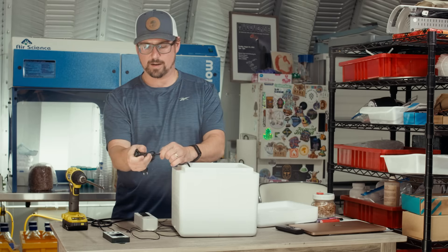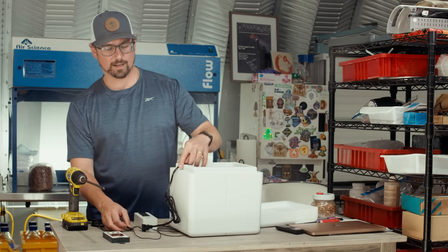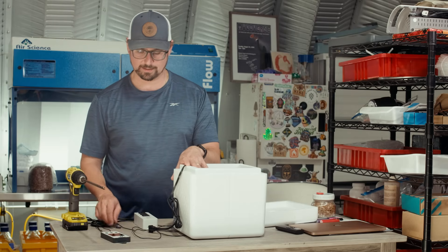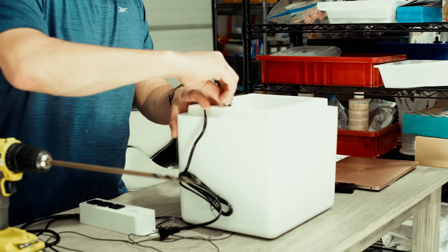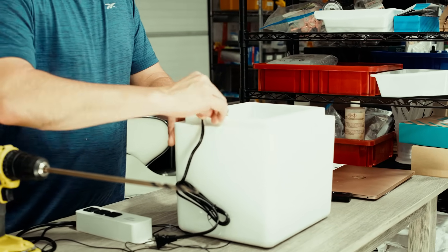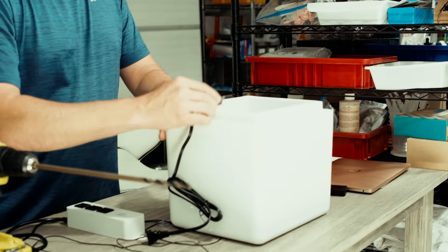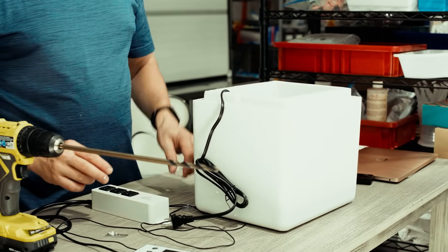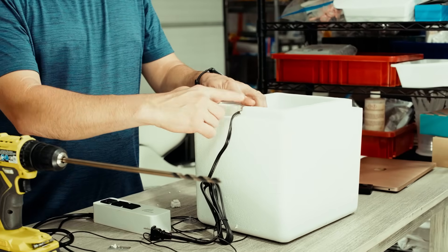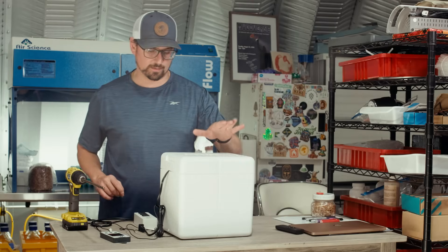I'm going to extend this cord out and cut a little notch here so the cord can easily plug into the thermostat. I'll make a really thin cut — it shouldn't cause too many issues with temperature, but if you're concerned you can fill it in with some foam. That stayed closed really nicely.